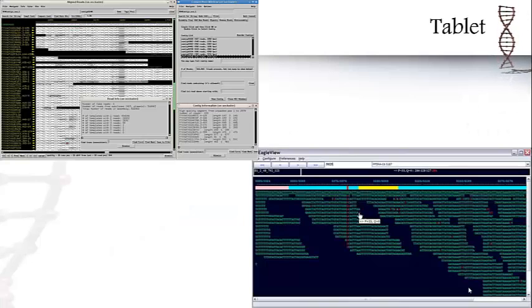The graphics in Tablet are actually pretty cool. As you can see from some of these pictures here, Tablet also shows an overview and data layout and coverage information.